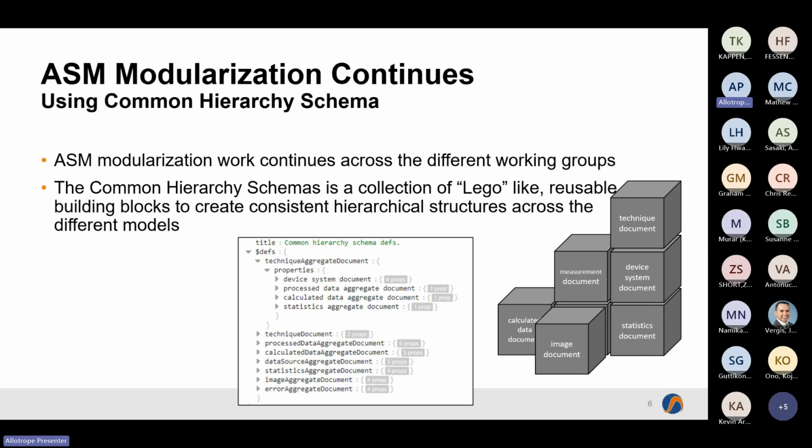We've been applying those throughout the suite of models and expanding them based on needs and use cases as we discover there are things we want to add that again become common. Things like the custom information document that's been mentioned a few times today. That's one of the things that have been added in more recent versions as we've learned we need a place for custom information that's not actually part of Allotrope in the common core.